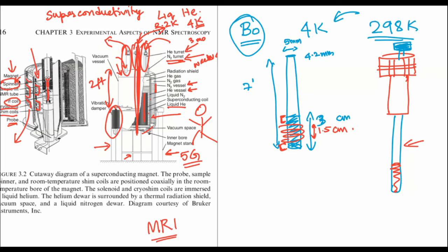If you apply forces along X and Y, the resultant vector will be along Z, correct? So yes, spinning also works the exact same way. That's how people spin the sample within the NMR tube. This is solution state spinning and you spin at something like 20 hertz.